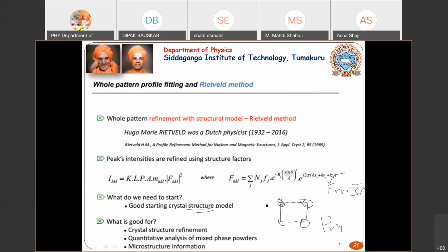And then you need a good XYZ parameter, which is the atomic position parameter. I cannot give my XYZ as 1/2, 1/4, and something like 1/3, because this is an arbitrary number. If I have a simple cubic, then it can be 0 0 0. If this is my x-axis, then 1 0 0, and if this is my y-axis, then 0 1 0, and the last one is 1 1 0, if I am taking a two-dimensional one.